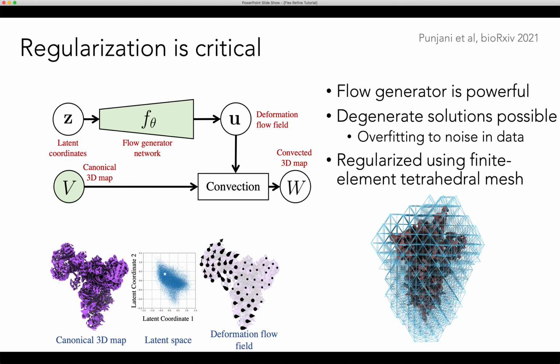The job, along with creating the mesh in terms of its vertices and cells, also assigns rigidity weights to each cell of the mesh so that some cells are considered by the model to be more rigid than others. This is useful for preserving geometry of the dense, rigid regions in the core of a protein, but also allowing empty space around the protein to deform as needed so that the motion model can move around parts of the protein that should move. By default, this mesh, as I mentioned, is fully continuous and covers the entire object.